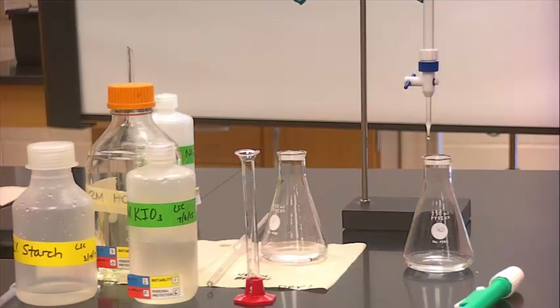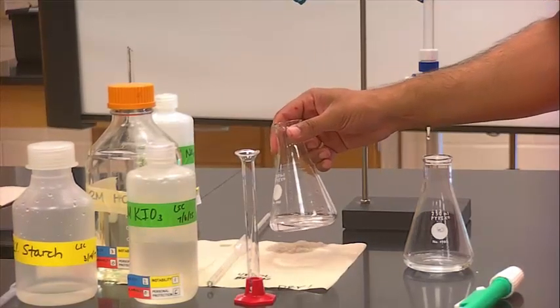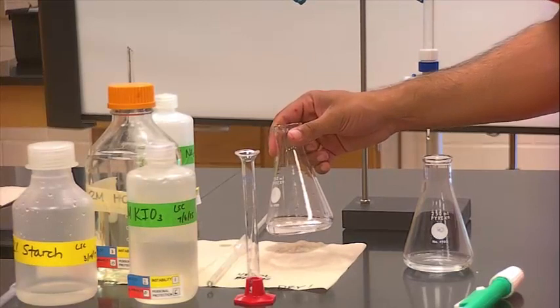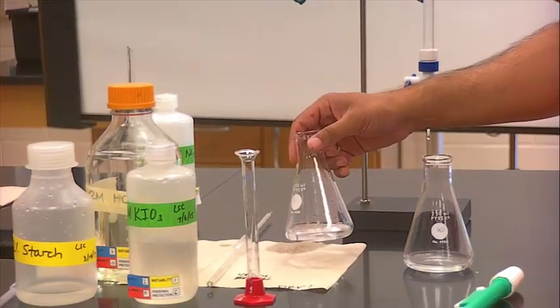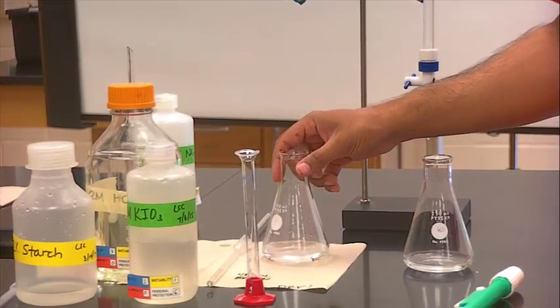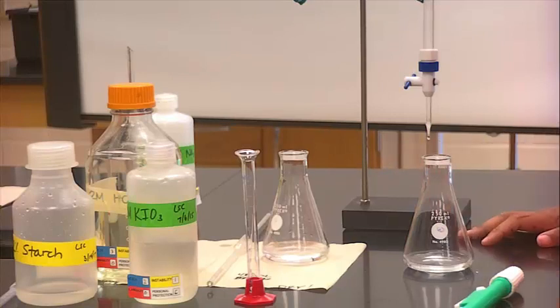So 4 titrations are going to be done. You're going to do an approximate titration, an exact titration. That is going to be from the precipitate that was dissolved in 40 mils of water. And then you have your precipitate that was dissolved in 80 mils of water. That was filtered. That filtrate, you will do an approximate titration as well as an exact titration.